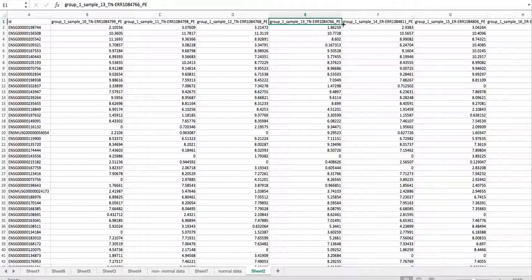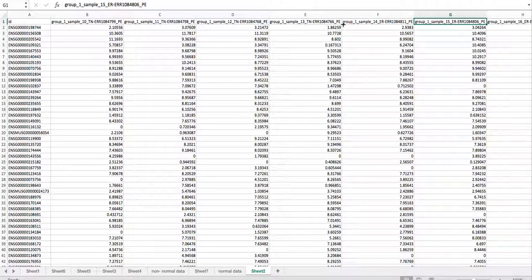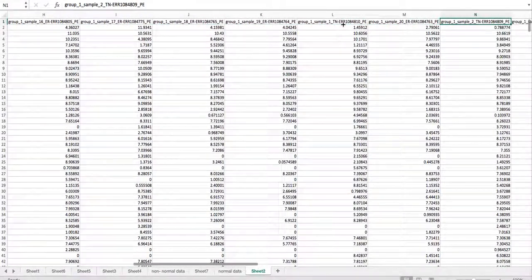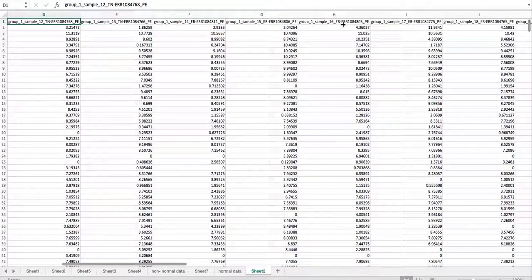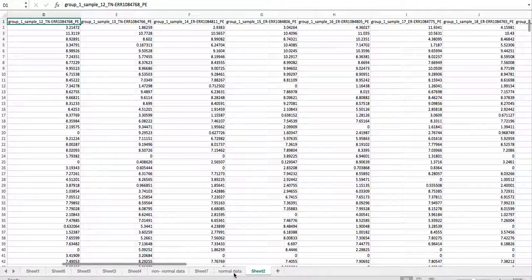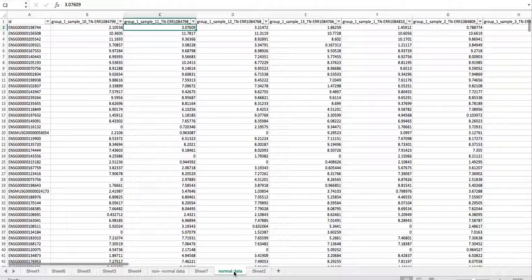One important issue is that the samples are mixed up together — you have your ER samples and your TN samples all mixed together. You'll want to separate them by cutting and pasting so they're grouped together, which will make the analysis a lot easier. I've already done this so I won't waste your time shuffling them around.